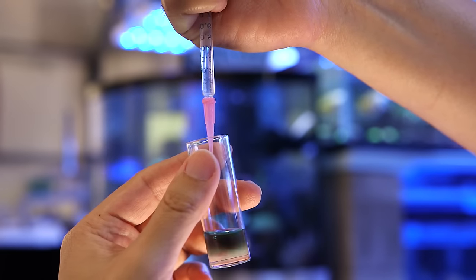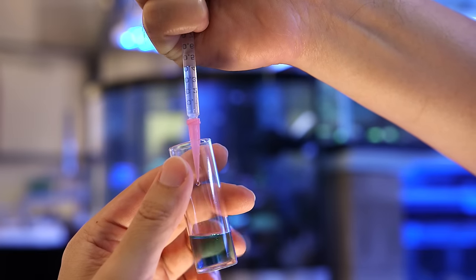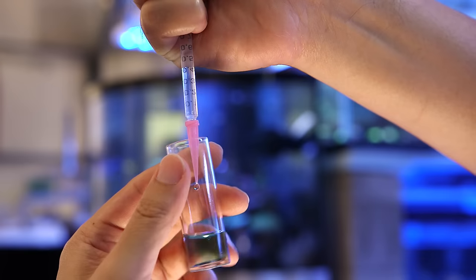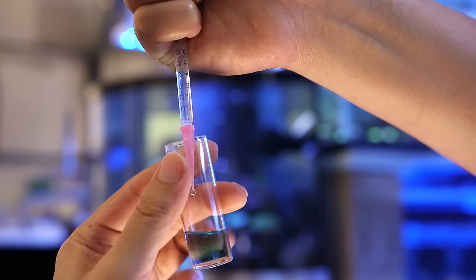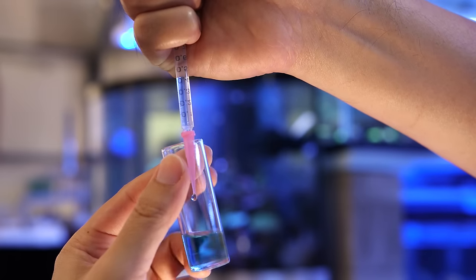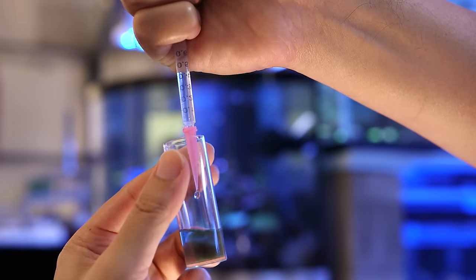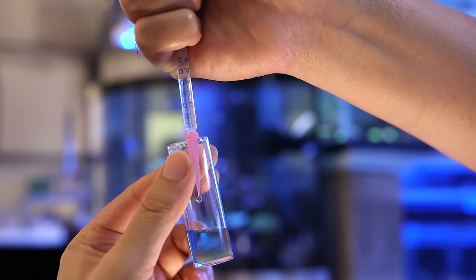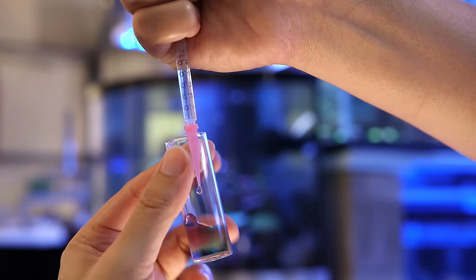When doing the titration, add the reagent drop by drop until you see a color change. We want to see the exact amount of reagent that it takes. A good titration will show an immediate change once the buffering capacity is exceeded — literally, one drop will instantly change the color of the solution. I try to give the sample container a flick or two between drops just to mix it in.